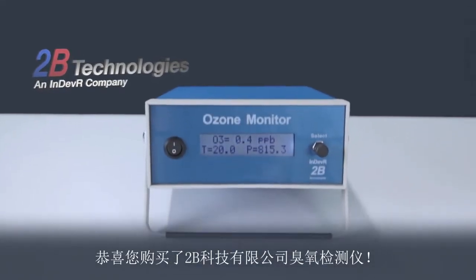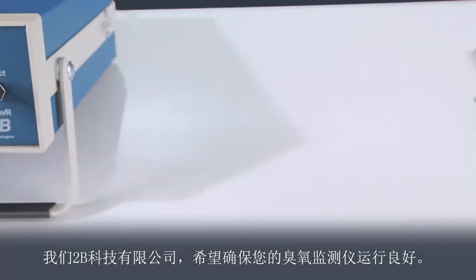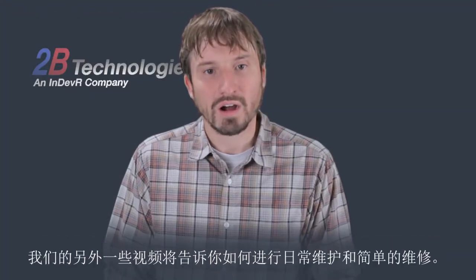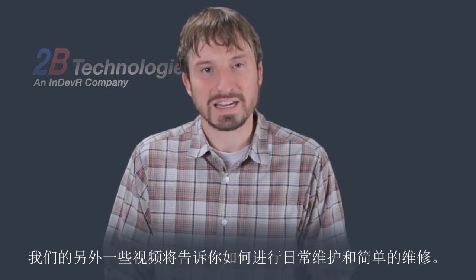Congratulations on your purchase of a 2B Technologies ozone monitor. We at 2B Tech want to make sure your ozone monitor performs well for you. This short video shows you how to set up your ozone monitor and how to start making measurements. Our other videos will show you how to perform routine maintenance and make simple repairs.